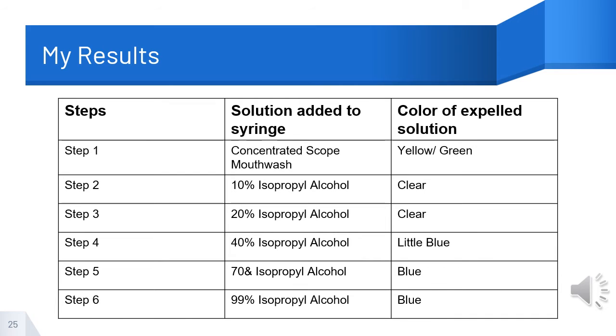This table shows the steps, the solution I used in each syringe, and the color expelled in the solution.